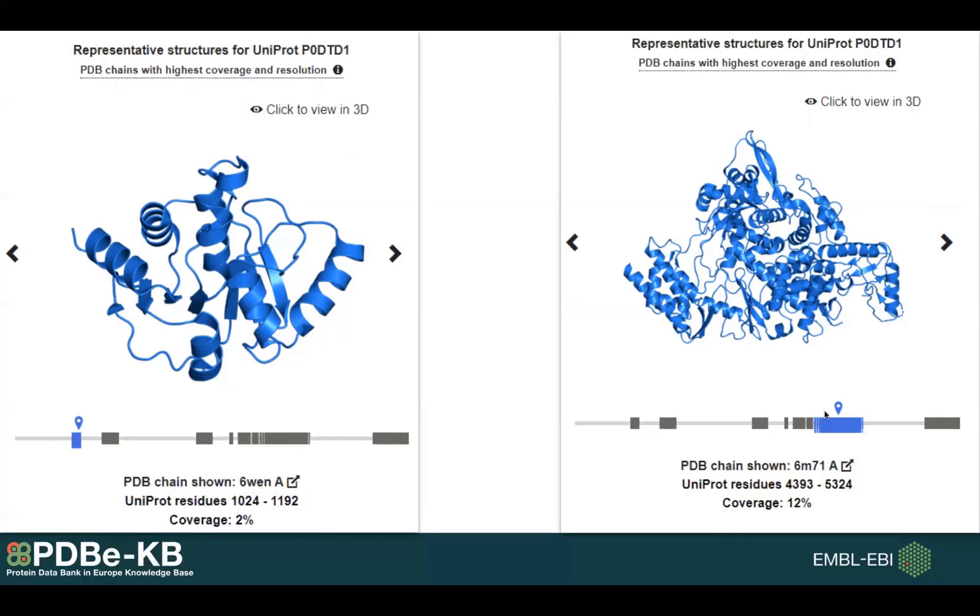But if you are interested in a different part of that protein, you can use this panel to navigate between the different sections. You can see that for that region the representative PDB would be 6WEN.